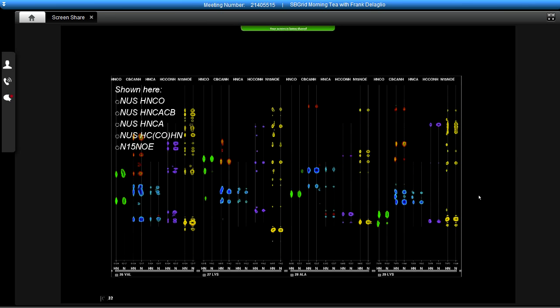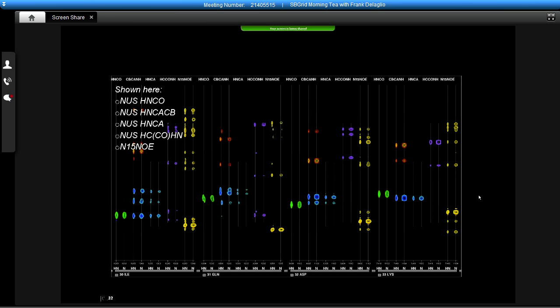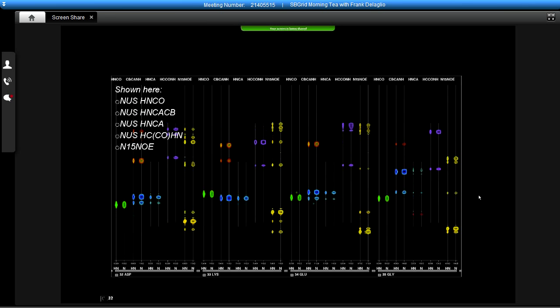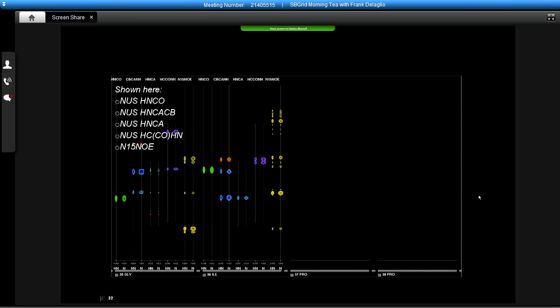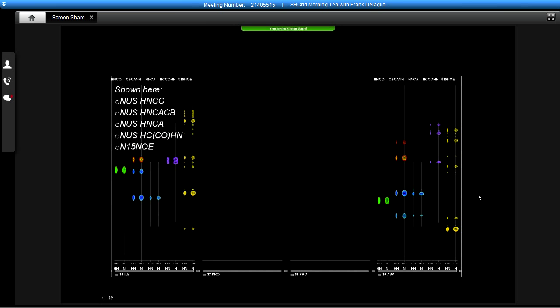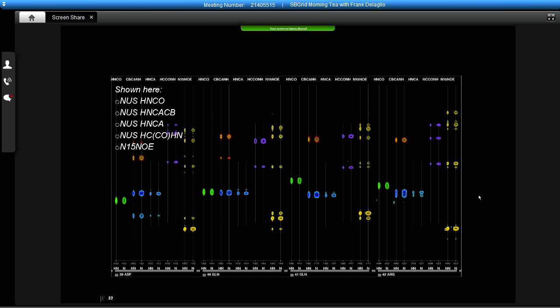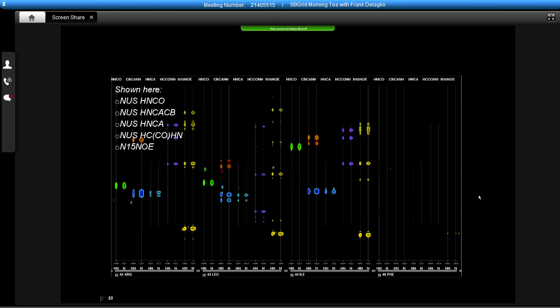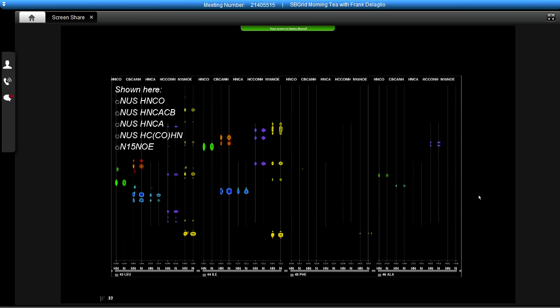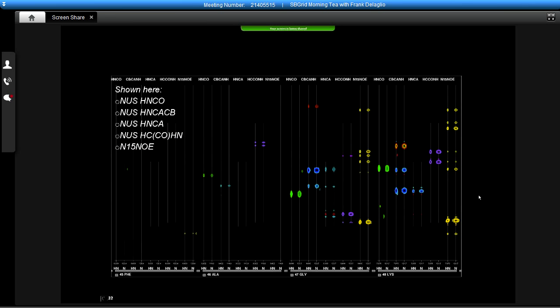So the total measurement time was reduced by a factor of 4 in this case for each of the triple resonance spectra. And what you're seeing here are the corresponding strips in both the proton and nitrogen dimensions for all the residues in this particular protein, which is, of course, the pet protein of biomolecular NMR, ubiquitin. And you can see the results are beautiful. They look like nice conventional spectra, nicely clean.